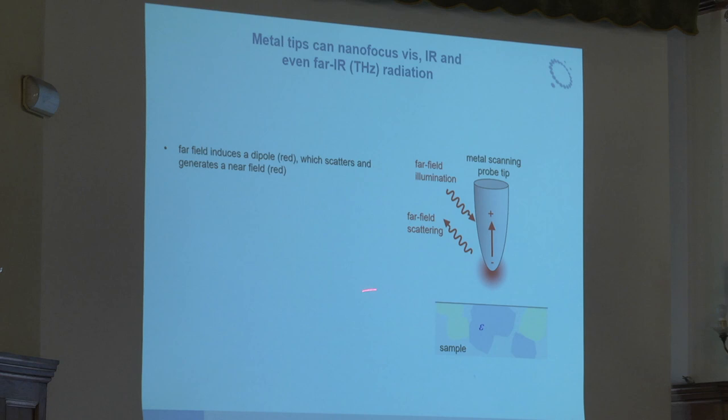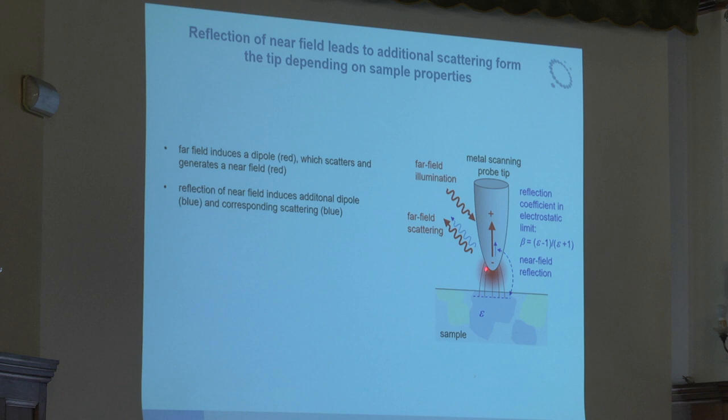But once this near field, to a certain extent on the scale of the tip radius, reaches the sample surface, then these near fields, similar to a propagating wave, can be reflected. A very simple picture. And this reflection can actually be described by Fresnel reflection coefficients.